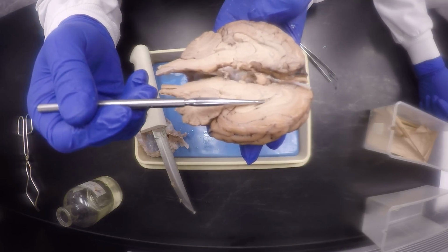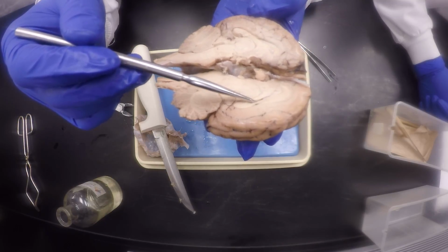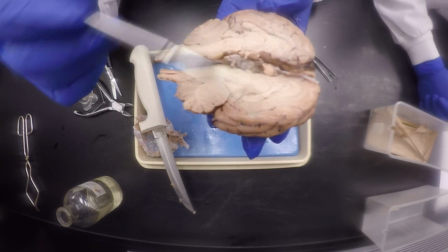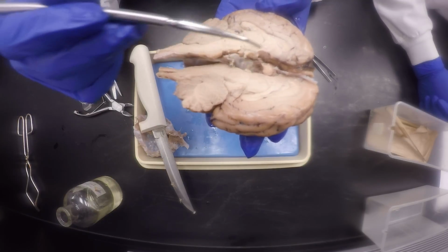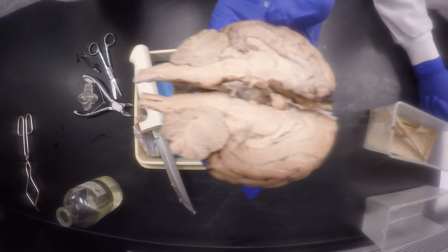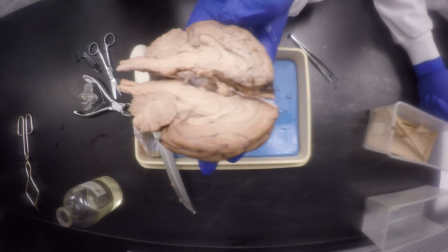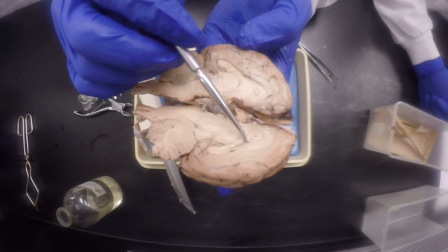You see the choroid plexus? Remember those blood vessels that are covered by ependymal cells that create cerebrospinal fluid? So that's the choroid plexus. The lateral ventricles are 1 and 2, but we just call them lateral ventricles. They're separated by the septum pellucidum, which is this. That is a very thin layer. You can never cut it in the middle, no matter how much you try, because it's just too thin. When you cut it, it always goes to one side, and in this case, it went to this side. You can see here it's open, and you can see the lateral ventricle.